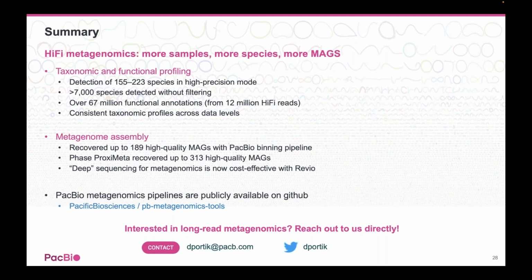Lots of functional annotations if you're interested in that information. And most importantly, consistent taxonomic profiles across data levels. From 0.5 gigabases to 100 gigabases, we get the same consistent profile.